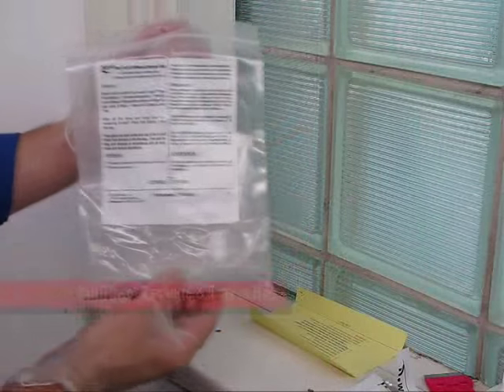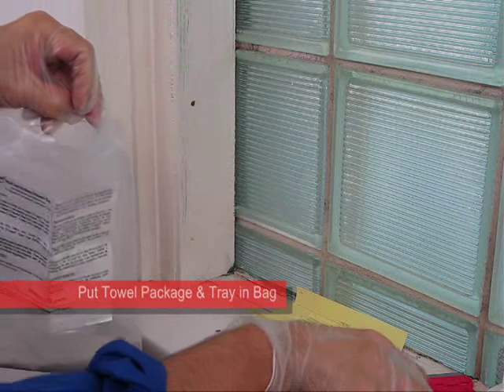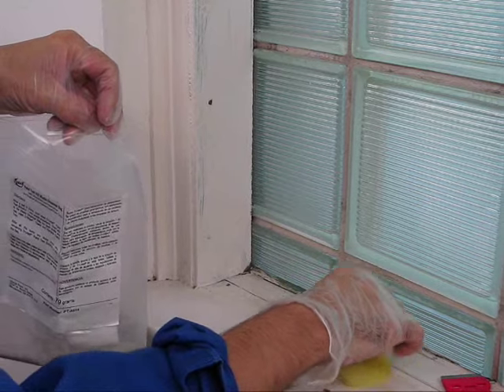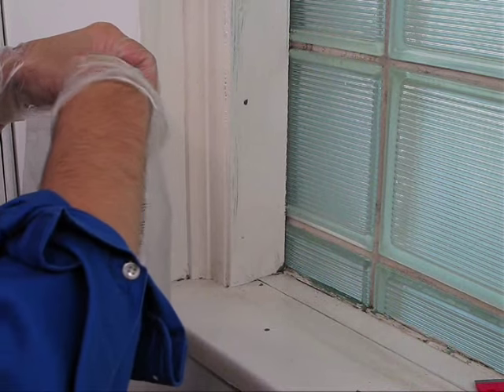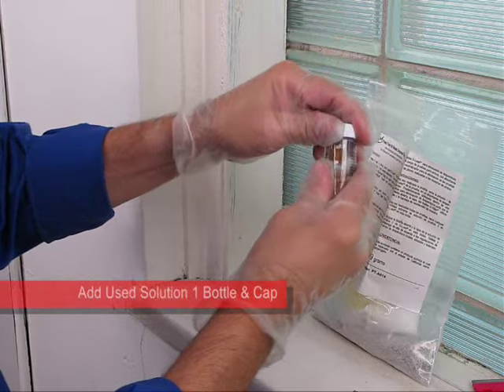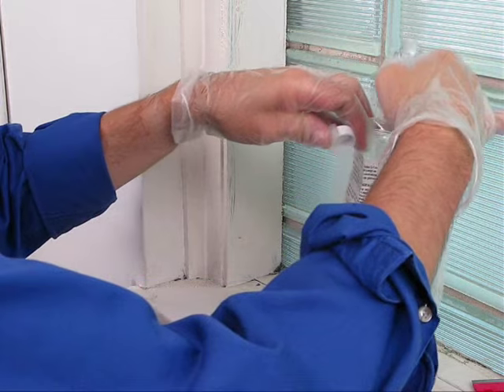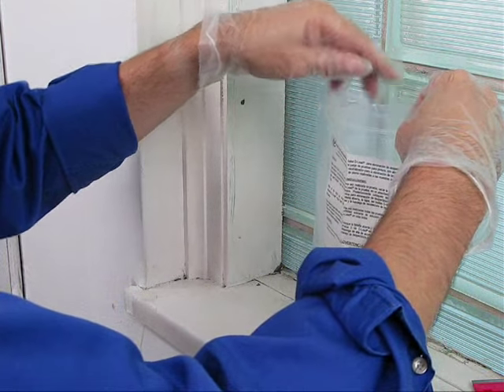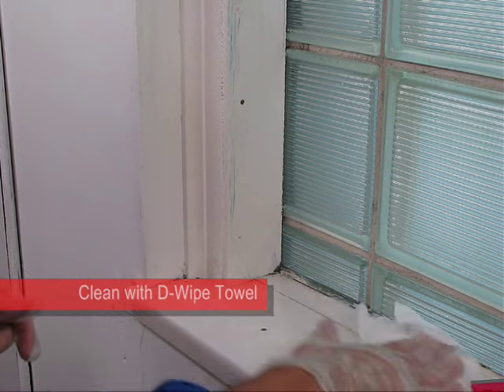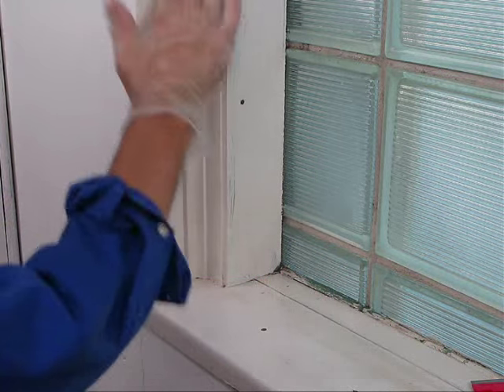After testing is complete, place the used de-wipe towel package and sample catch tray into the waste disposal bag provided. Add the used bottle of test solution 1. The absorbent material in the bag will neutralize the test solutions and bind the lead for safe disposal as non-hazardous waste. Wipe down the sample test area with the de-wipe towel to clean any remaining residue off the surface.